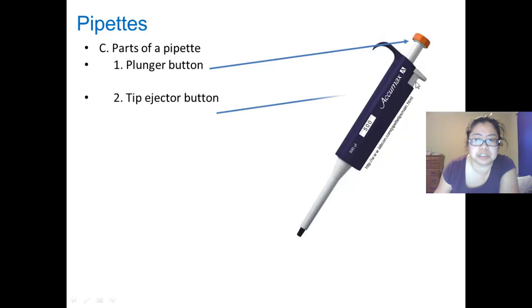The tip ejector button is used when you're done with the pipette tip. You hit the ejector button to release the tip into waste. The volume adjustment dial is where you turn and adjust how many microliters you need of liquid.